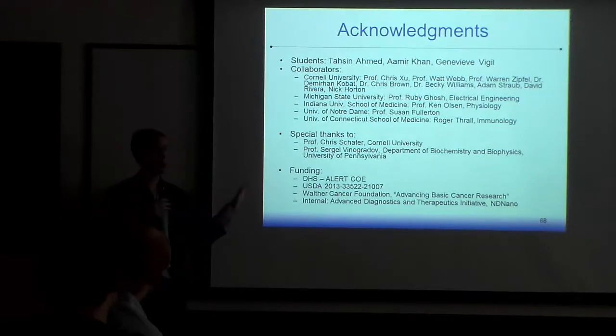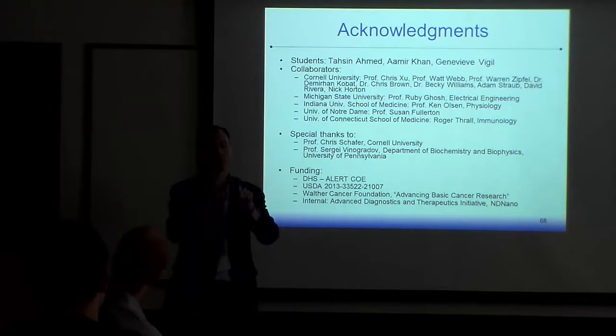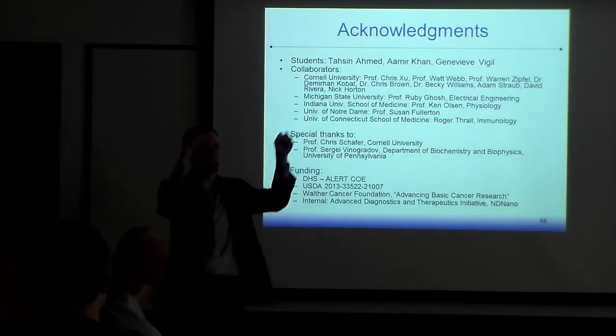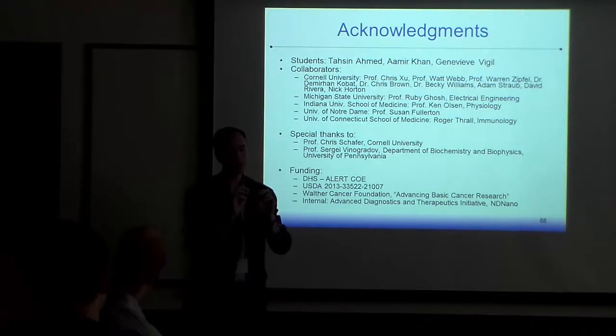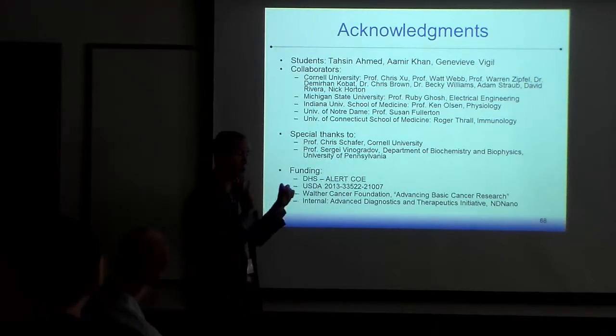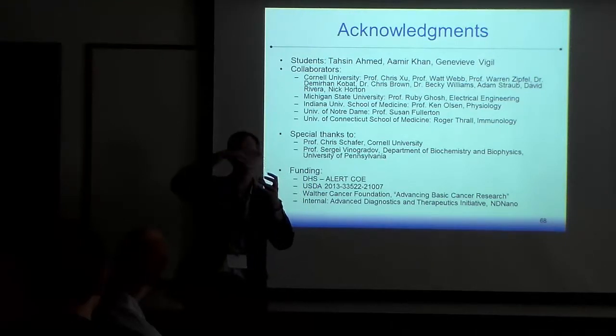This is one of the cool hidden things about multiphoton. First off, because of phase matching, it's very unlikely that any photon that scatters will cause a 2-photon event. So the 2-photon excitation points are only from ballistic photons, the photons that did not scatter to get to the point. And then you say, okay, well now it emits, it's just going to glow and bounce all over the place. Since I am multiplexing this in time, I know that every photon I collect, no matter where it scatters to or from, had to have come from this localized point that was created only by ballistic photons. So we just collect all the light back.